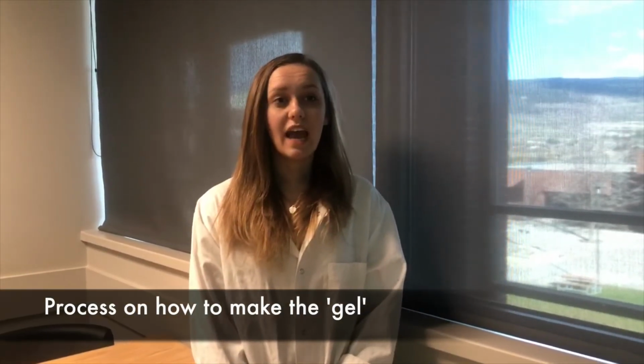Sorry, but did you even tell us how to make it? It's made by combining agarose and TAE buffer into a flask and heating it until the agarose has dissolved. SYBR is then added during cooling to allow the visualization of the DNA fragments under UV light.